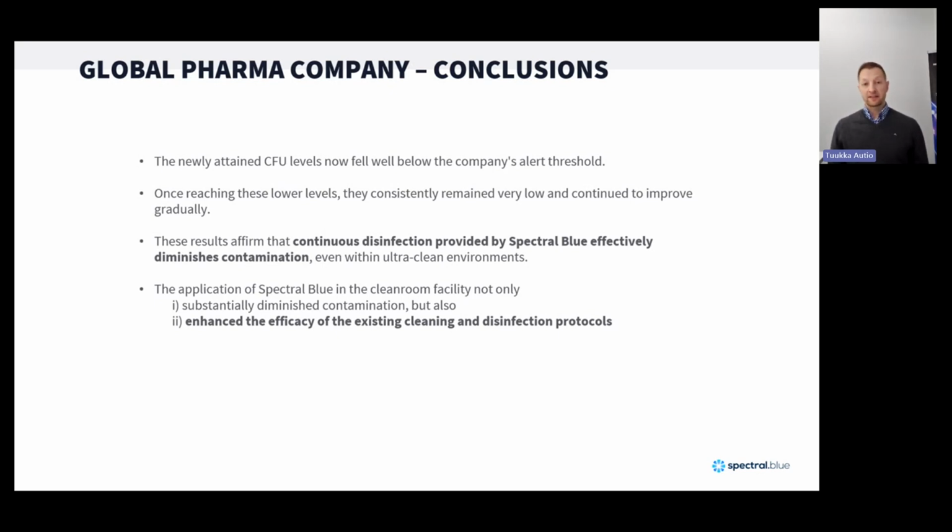Well, this was not specifically tested, but the customer themselves were speculating that, like Camilla said, they might have had a problem with dry biofilms in that room, which would mean that their standard normal cleaning practices could not penetrate the biofilm and could not get rid of that problem. But once they used blue light, they were able to eliminate the biofilms, and then continuing their standard cleaning practices could keep the levels down in the later weeks. But that was not, I repeat, that was not tested, but it's something that the customer themselves discussed as a potential cause.